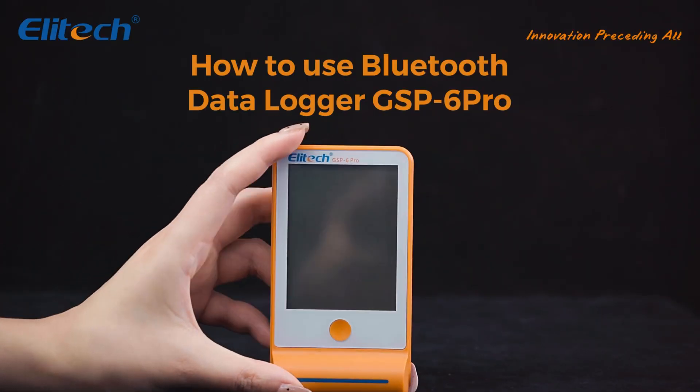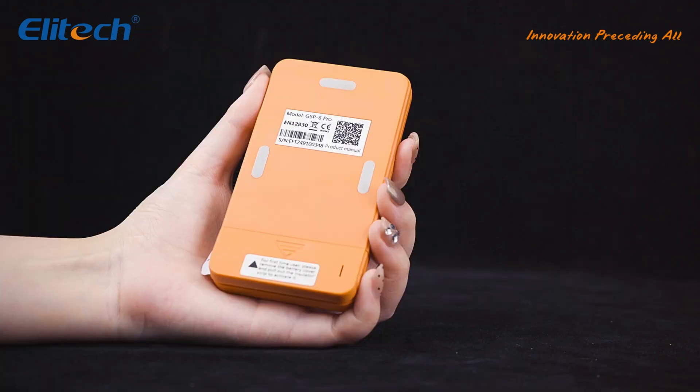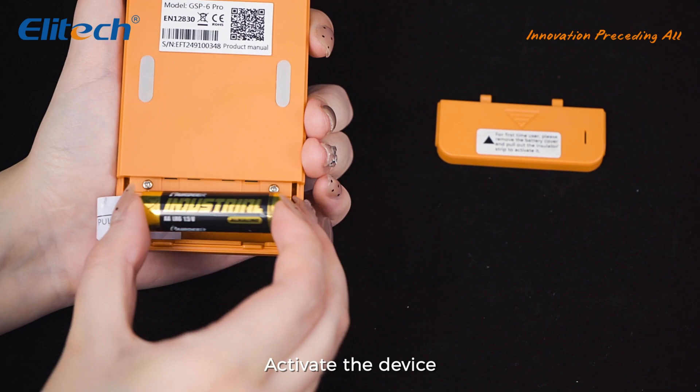Today I will show you how to use the Bluetooth Temperature Humidity Data Logger GSP-6 Pro. First, remove the insulating sheet and power on the device.